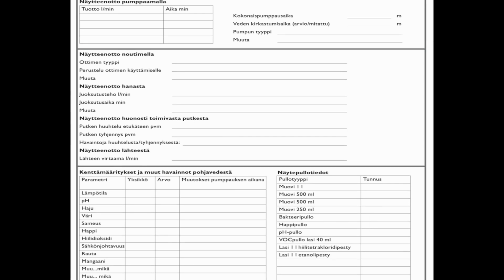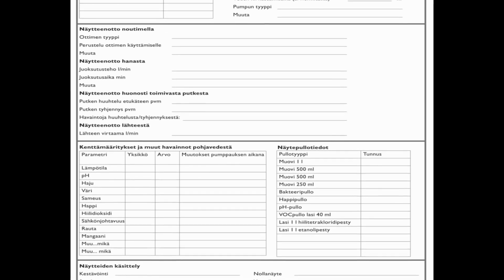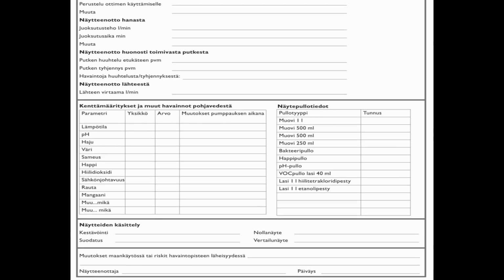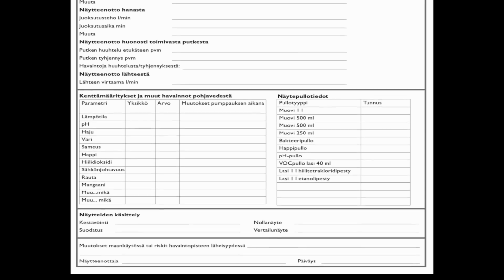Other field measurements of the water can also be performed according to plan, such as the pH value and conductivity using the appropriate meters. The field values are recorded in the sampling record. Sensory observations such as the smell of the water should also be marked in the record.